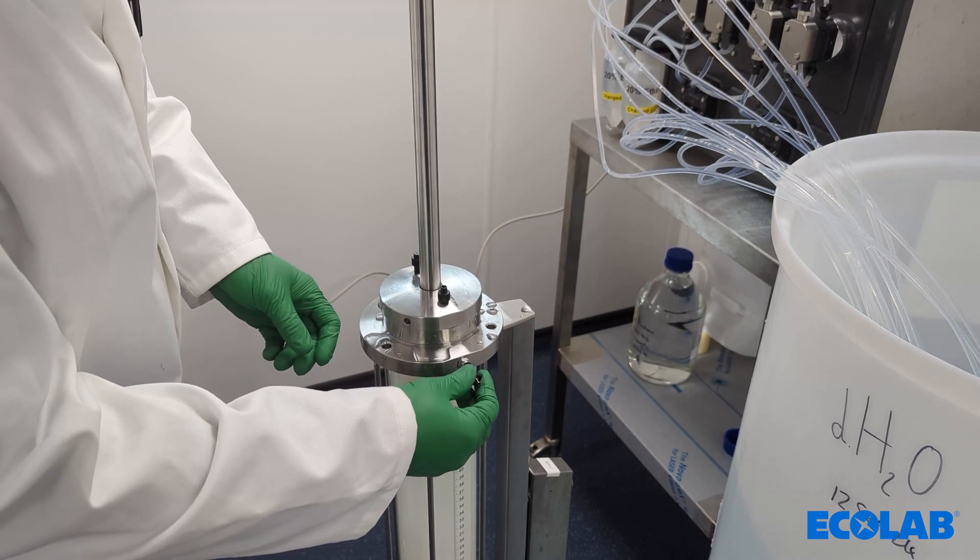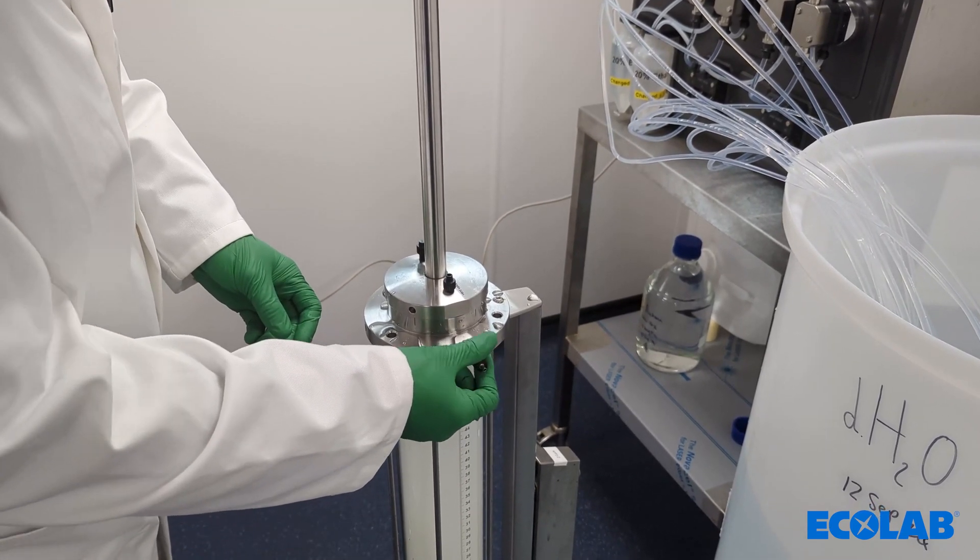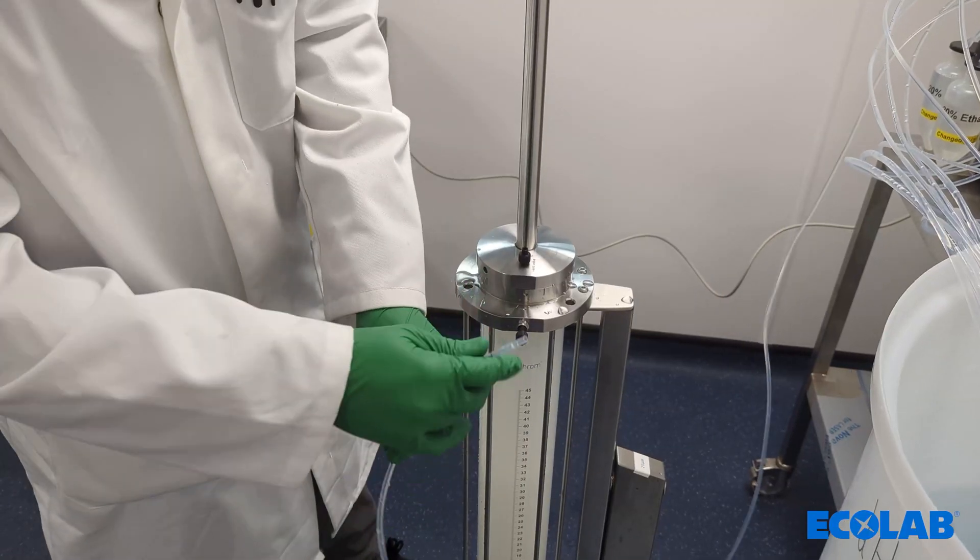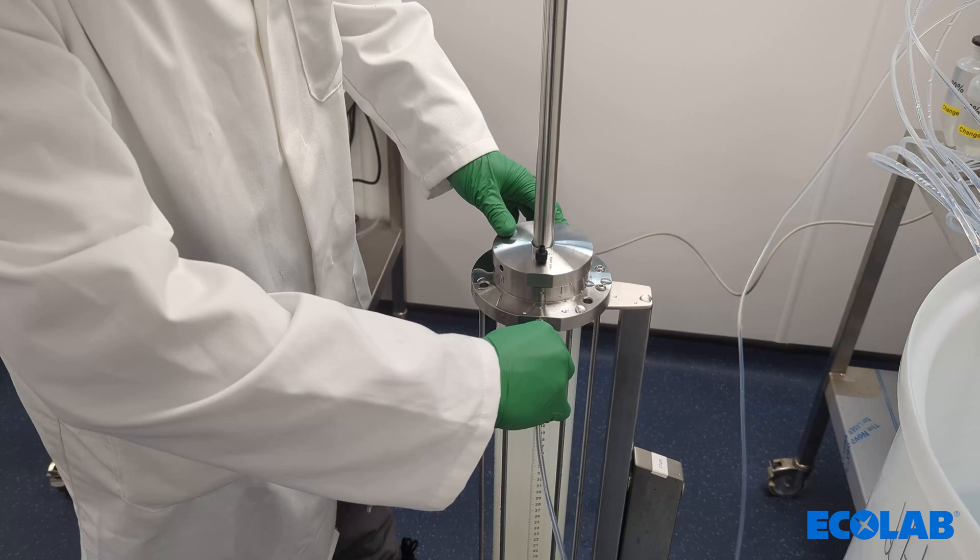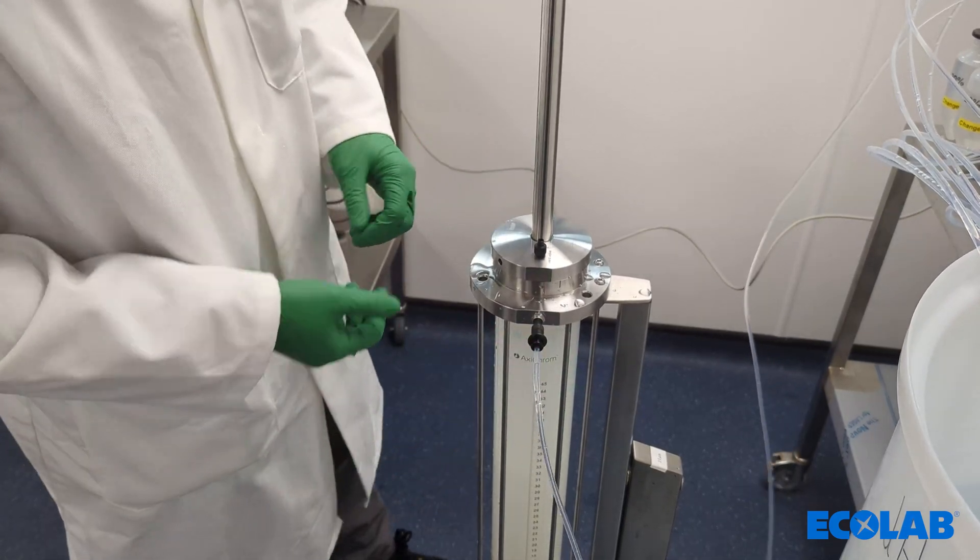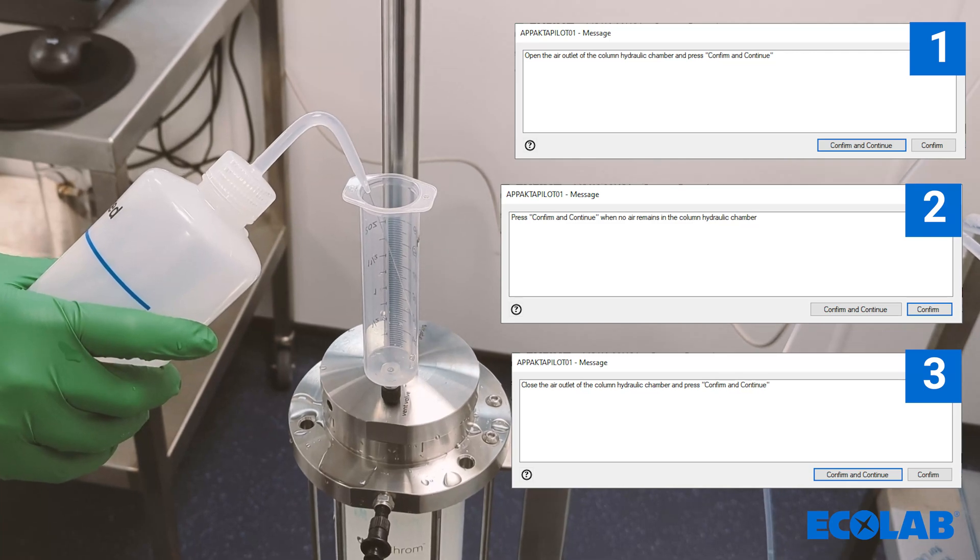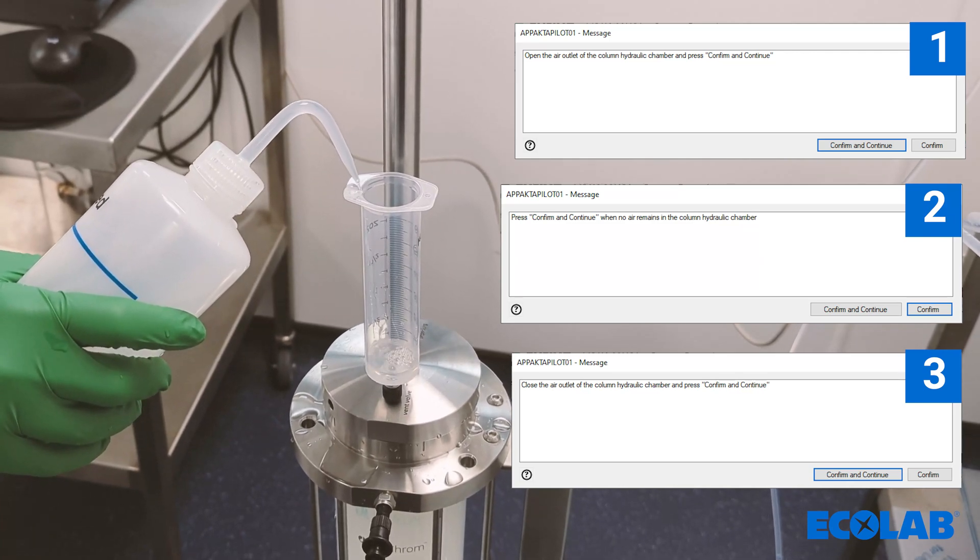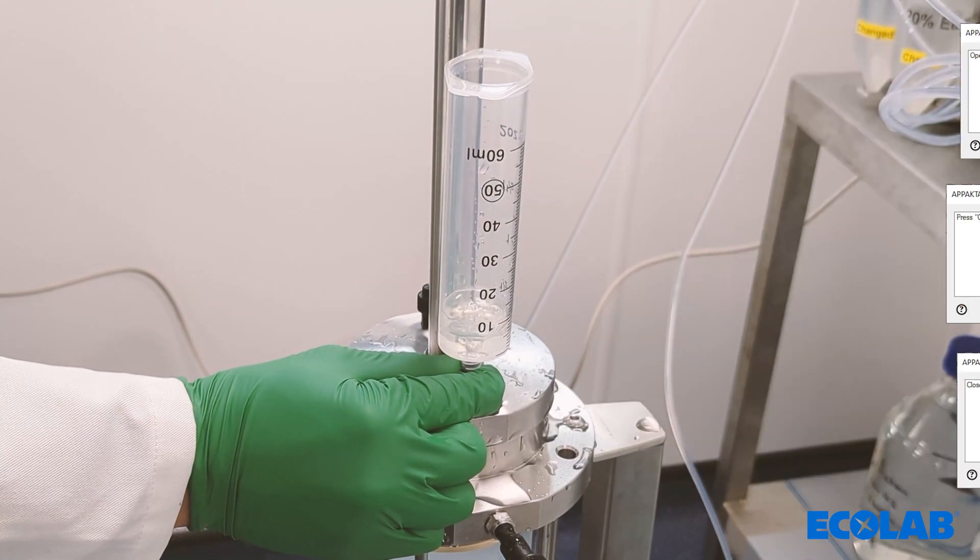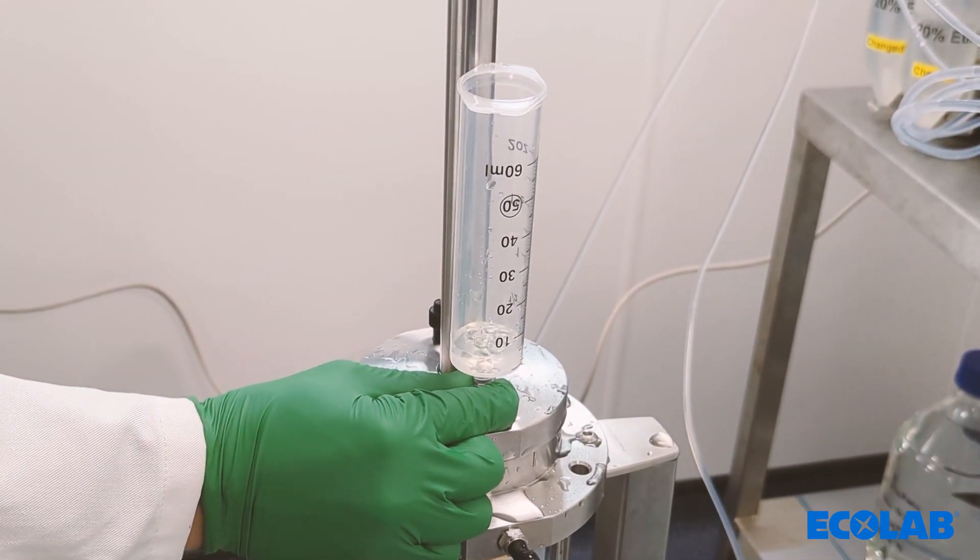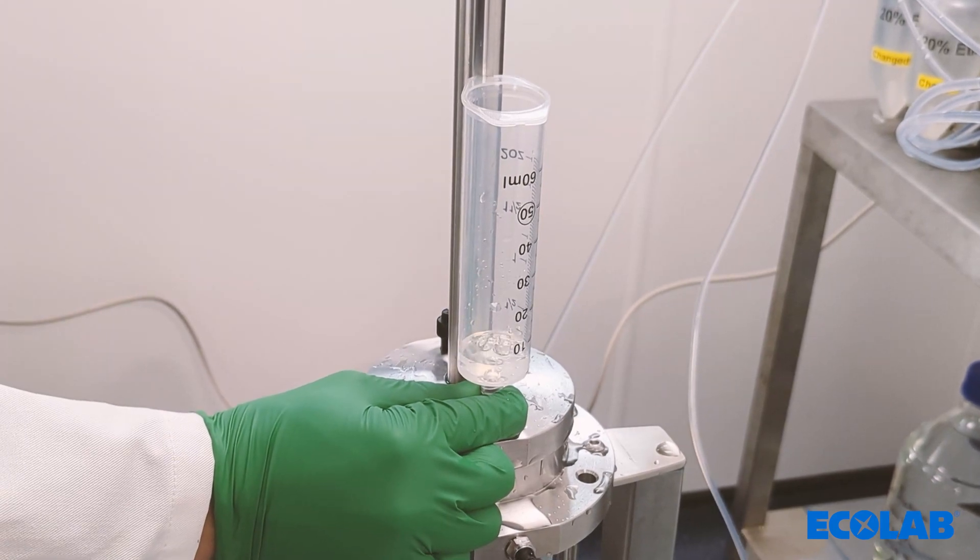Connect the intelligent packing line to the column. The intelligent packing will give you instructions for the priming. This involves opening the vent valve and allowing the air to be displaced by the liquid before once again closing the vent valve. It can be easier to use an open syringe with water as shown in the video to see the bubbles stop, indicating the complete removal of air.